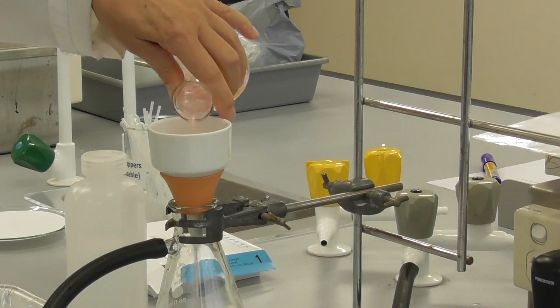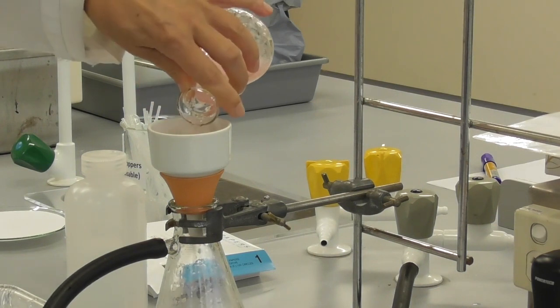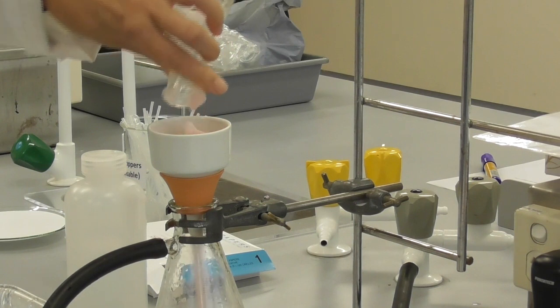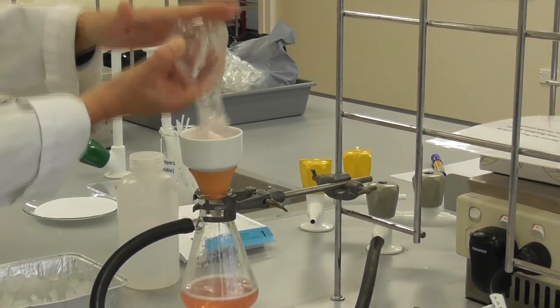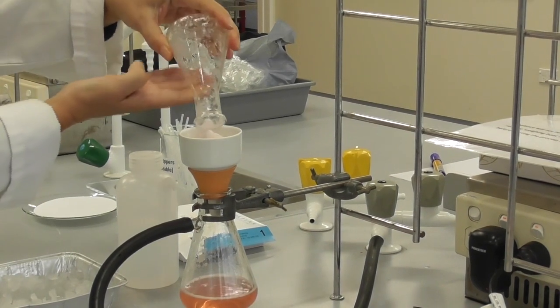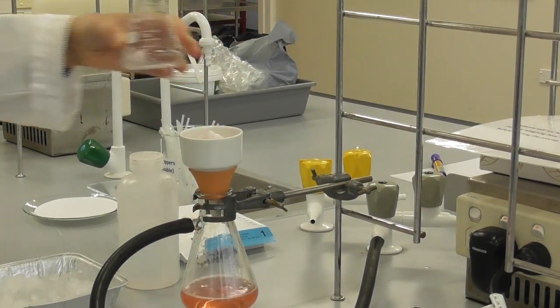We swirl the flask to create a slurry and pour this into the buchner funnel. We try to transfer all the crystals into the funnel by shaking the flask and possibly scraping the last little bit out with the spatula.